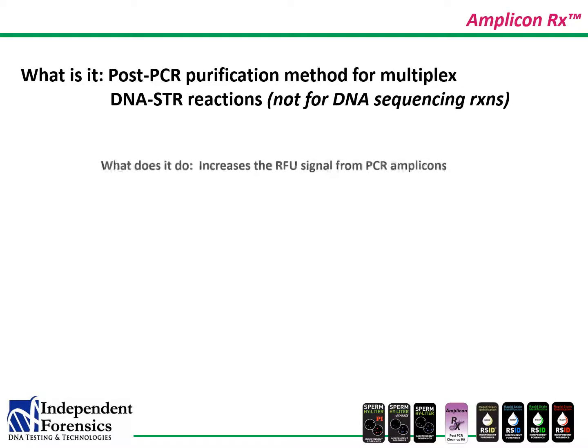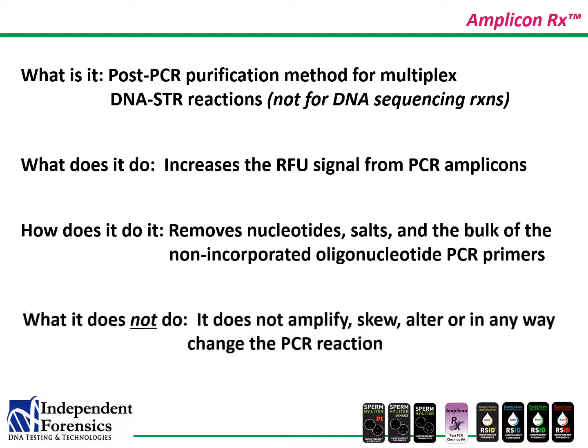Amplicon Rx is designed specifically for DNA multiplex STR reactions. It will not work effectively for sequencing reactions. It should only be used for STR reactions used in forensic labs.